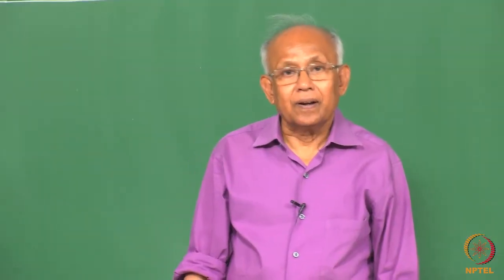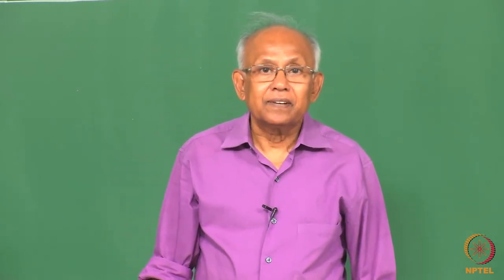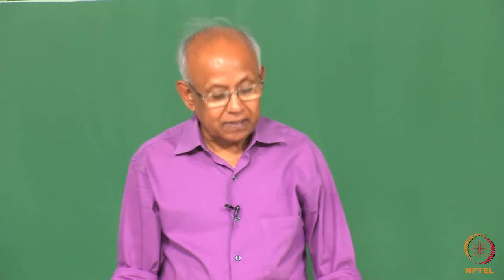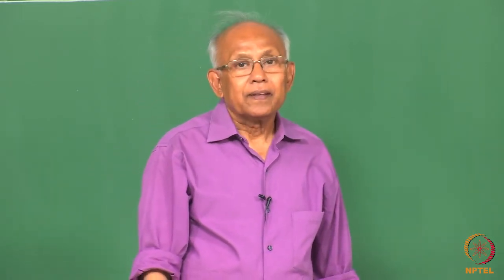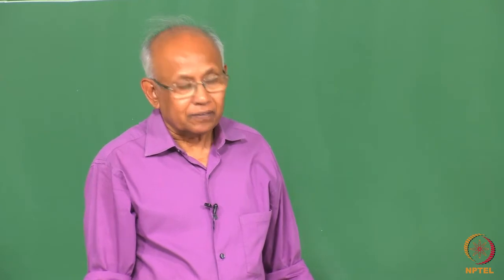In this lecture, I shall discuss the various X-ray diffraction methods that are available to study materials. There are, in general, three different X-ray diffraction methods.